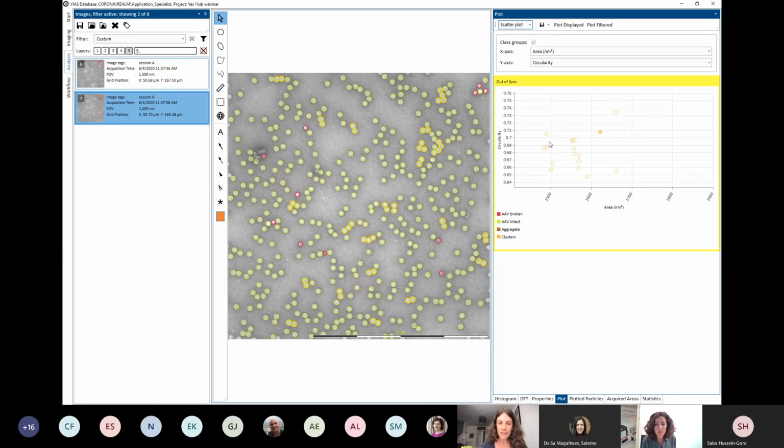And I was wondering if your analytical platform can also deal with sections through cells. I know you showed some sections, but in terms of the analysis, I wonder, because it's more crowded. There's lots of things going on inside the cell. So this takes a long time for us to do. And if that would work on sections, that'd be fantastic. It'd be really interesting to talk to you more about that.